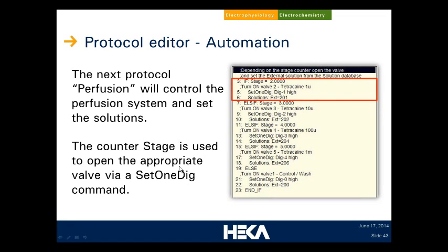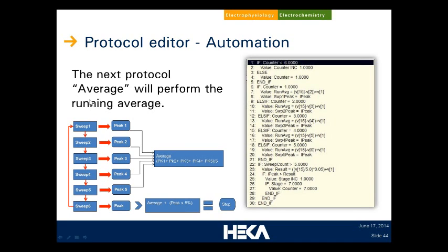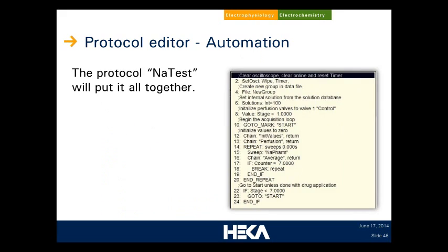Another tool is the chain protocol command, which allows us to modularize — to break down the execution of protocols into various components. The first protocol initializes all values to zero, used for counters and for doing the mathematics in my averaging. Then I wrote a protocol for perfusion control: I check a counter, and based on that I specify the digital control and change the solution database to match the current concentration. The counter state is used to set the digital valve on and off. All of these protocols and the data set are available for download, so you could try them and modify them as you like.